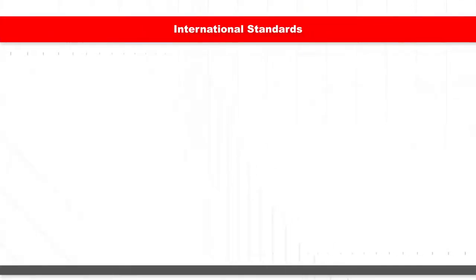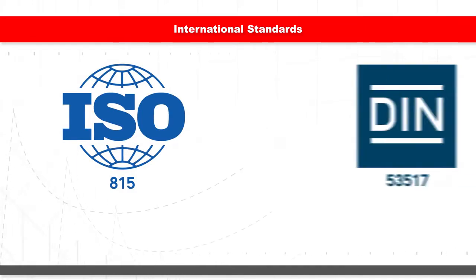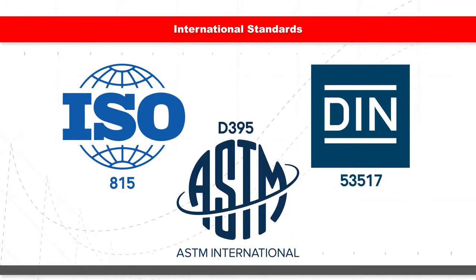The CS3000 Compression Set meets standards according to ISO 815, DIN 53517 and ASTM D395 and other international standards.